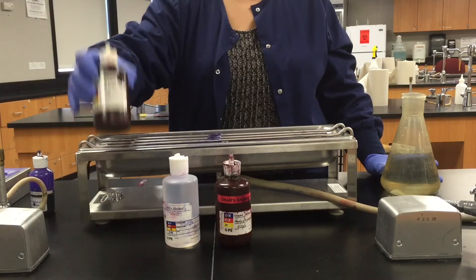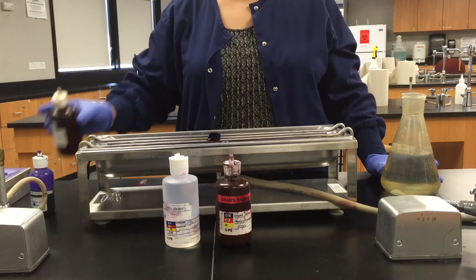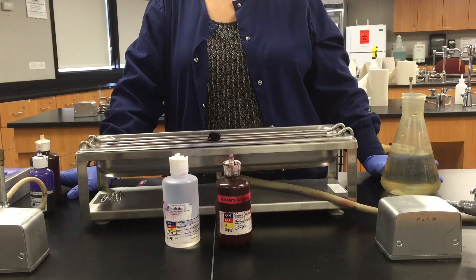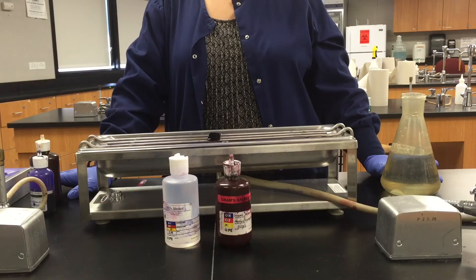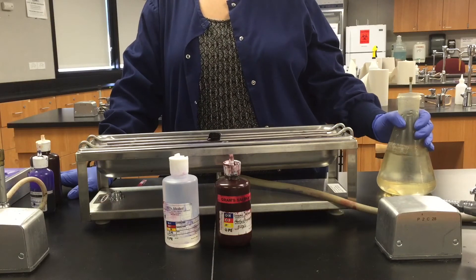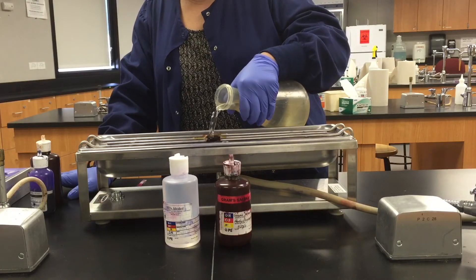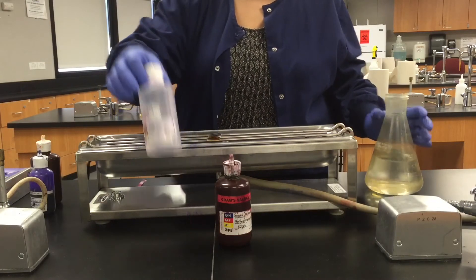Next we will apply Gram's Iodine — going to cover the slide with the Gram's Iodine. The iodine is acting as a mordant, which is a substance that's going to intensify the bond between the Crystal Violet and the cell wall. We're going to give that a rinse, and the next step is decolorizing.